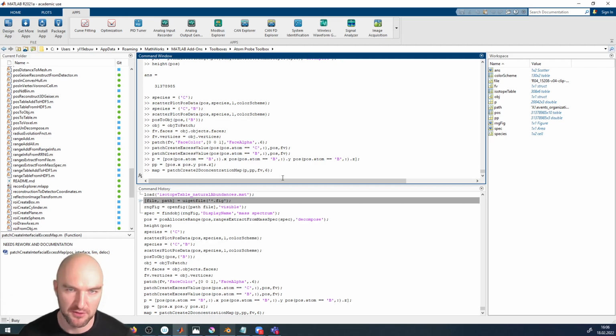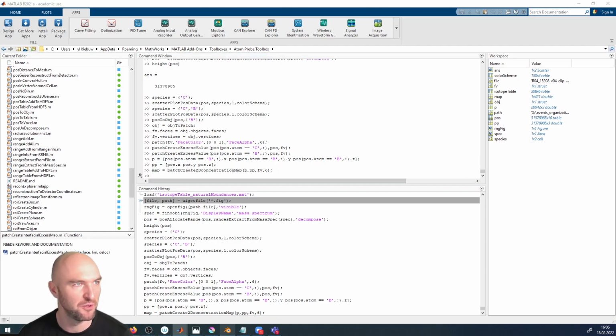So in order to fix the problem here, that you needed to pull out the coordinates from the individual species by hand, fixing that is actually fairly simple because it's essentially really just those two lines, and we're going to put them into the code. The problem with that right now is, of course, we would have to redistribute the toolbox to you. So that would just hurt us a little bit in our workflow.